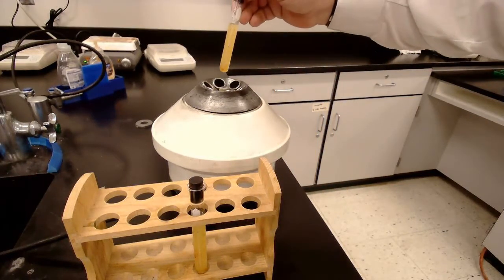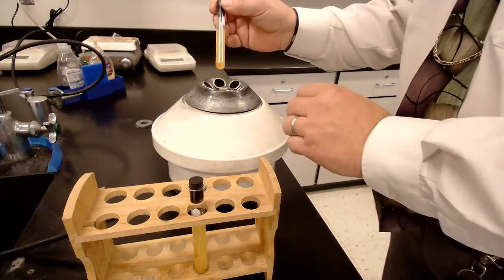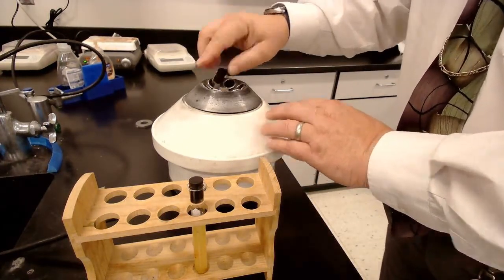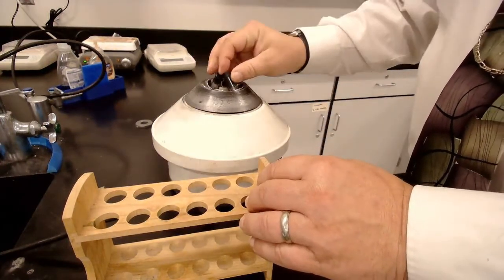So, now what we're going to do is we're going to take the Italian dressing and we're going to stick it into the centrifuge.